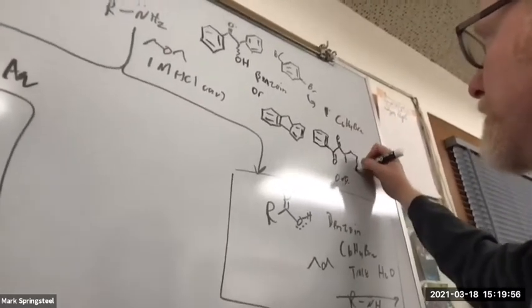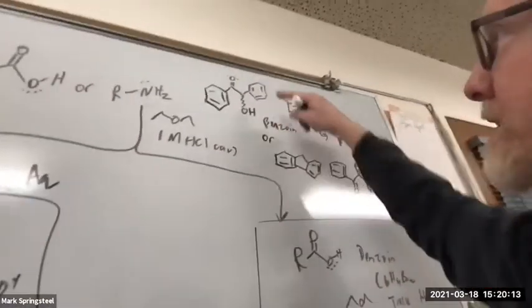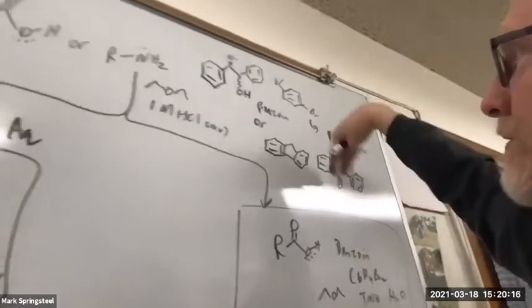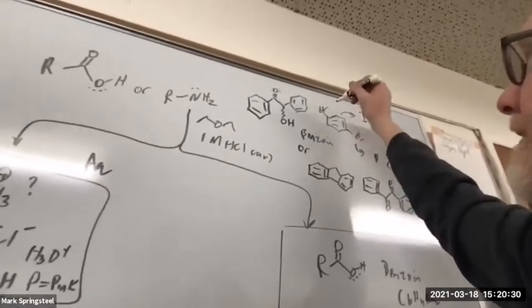So we don't know which of these it is, but we know that all three of these do not have a carboxylic acid or an amine. So all of them won't react with the HCl or the NaOH. They're going to always stay neutral charge, no charge, and so they can wind up in the organic layer the whole time. This is something we're going to have, and we're going to know we have it. We're going to treat this like an impurity, so we're going to try to get rid of that. There's going to be less of this.